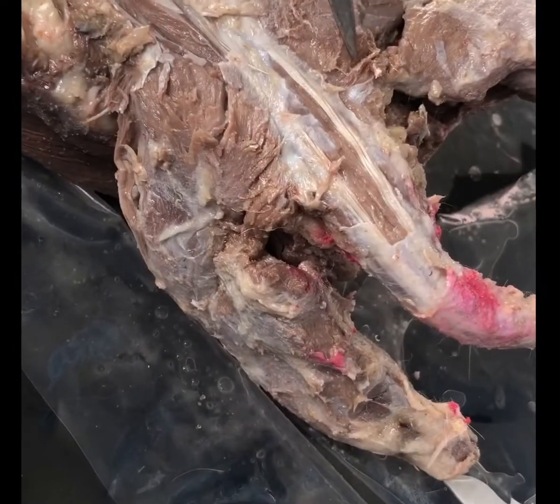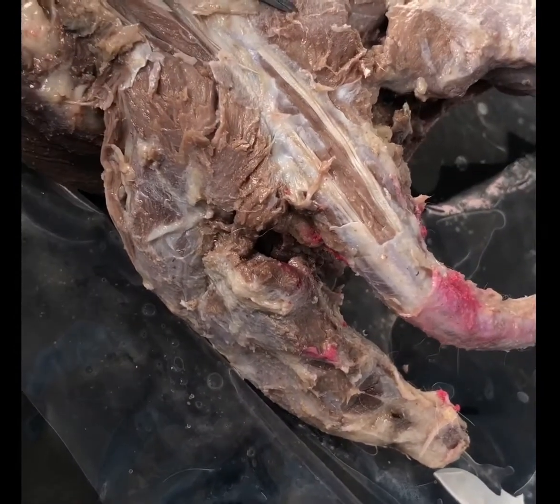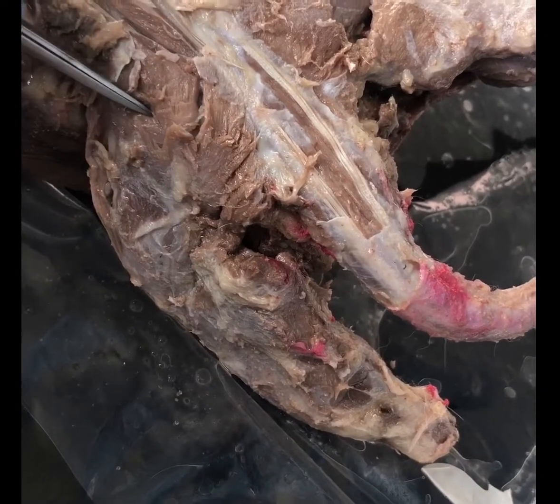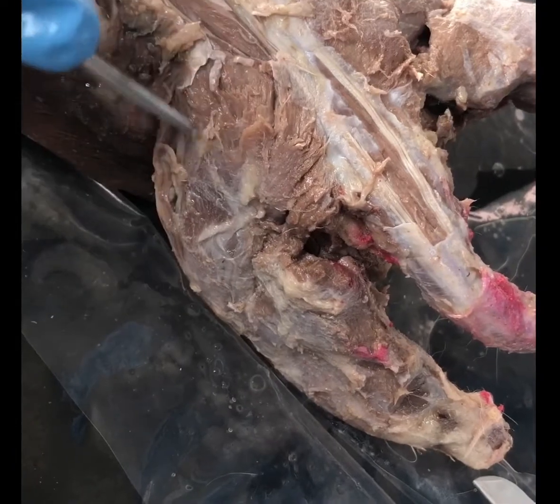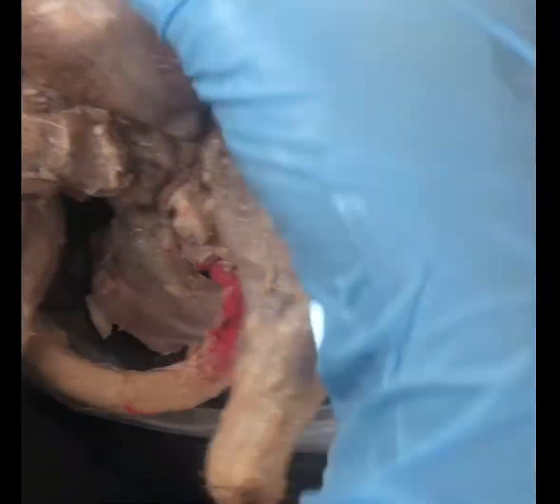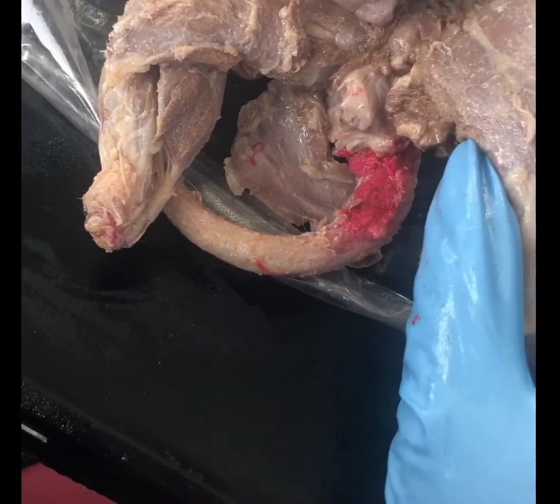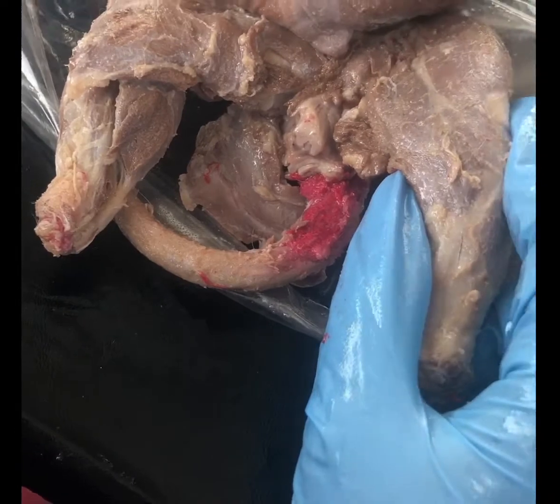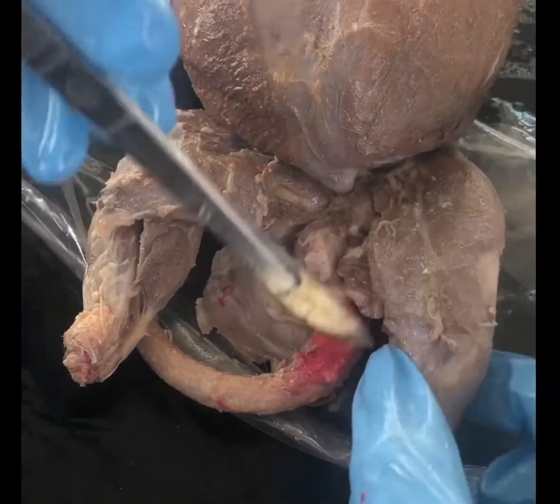Okay, this is the gluteus maximus, which extends the thigh, and then the gluteus medius, which abducts the thighs right here. This muscle right here. Okay, so now the leg muscles, the sartorius, which flexes and laterally rotates the thigh, is on the anterior side. It's right here. This muscle right here.